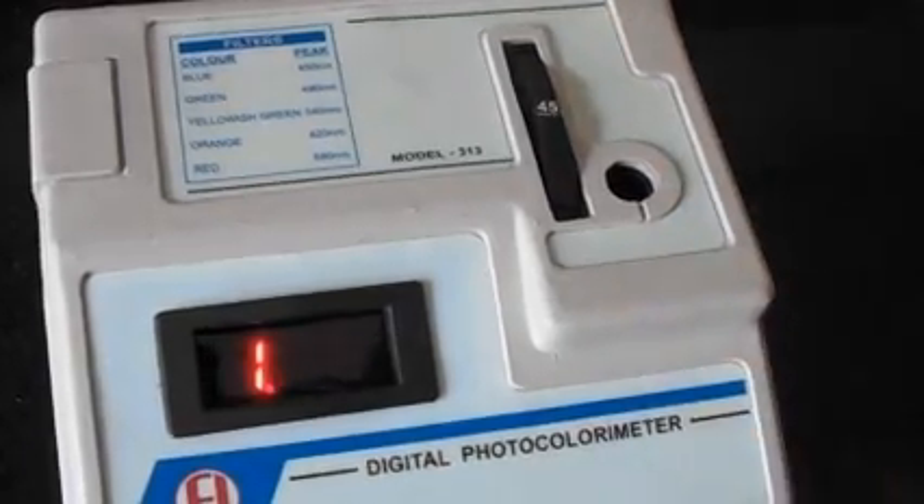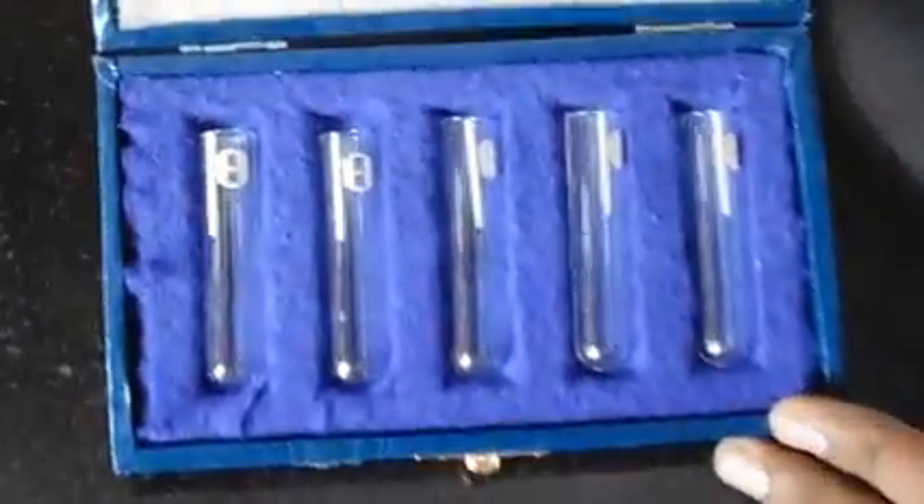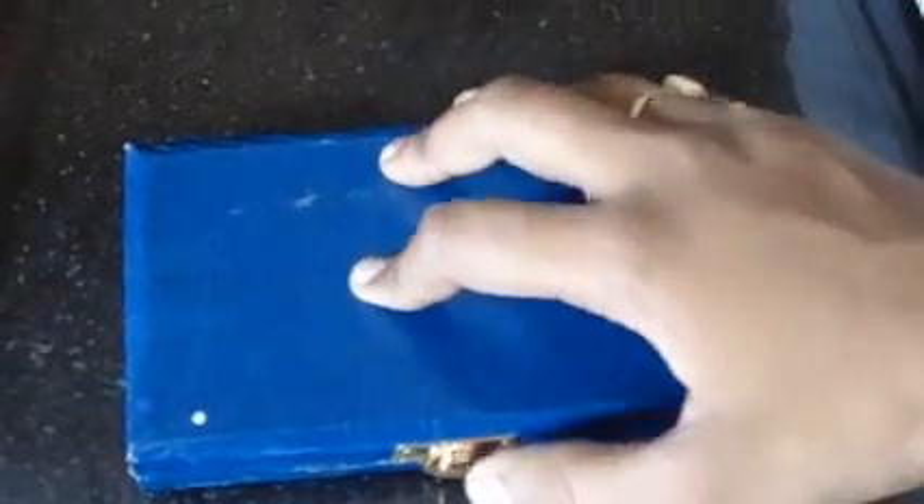When a test tube is inserted — these are the test tubes that come with the instrument. There are different test tubes, a set of 5.